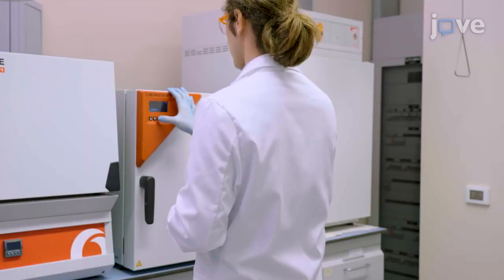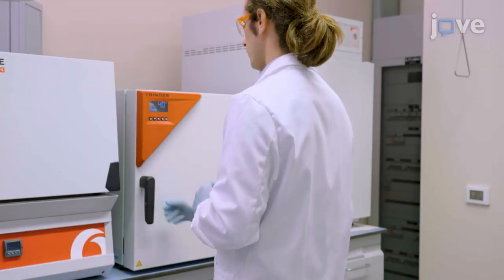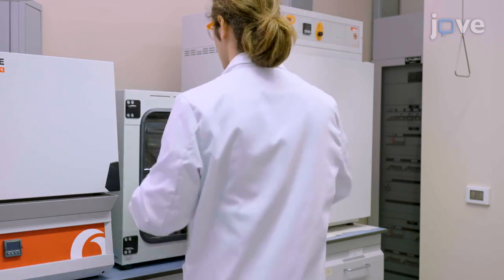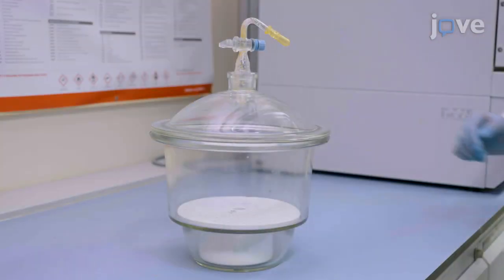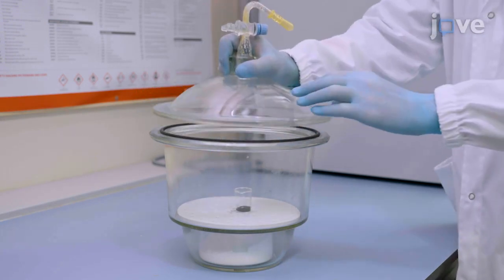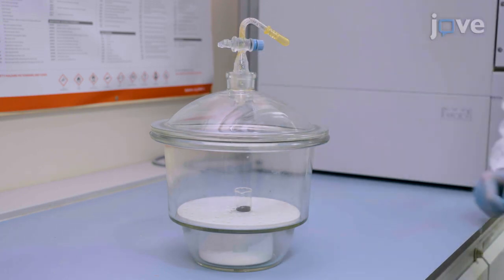Begin by pre-treating 100 mg of the lignin or tannin sample by drying overnight in a vacuum oven at 40 degrees Celsius. After drying, rapidly transfer the sample to an anhydrous calcium sulfate desiccator until it reaches room temperature.